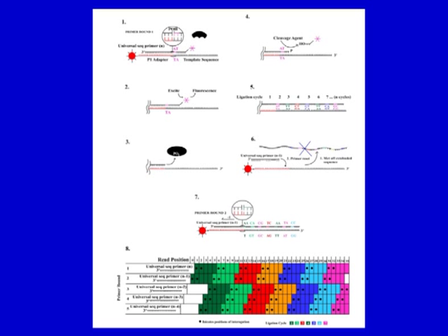bases. You can say these are 2-base probes, dye-based probes, and these are 6 to 8 bases long. When they are attached through ligation and finally removed, fluorescence can be read, and then these steps are repeated. Finally, primer reset is done, where this whole thing is removed and a primer of n minus 1 base pairs of the original primer is taken. Then again these steps are repeated, and almost 5 cycles are done, each time with one nucleotide removed, like n minus 1, n minus 2, likewise.